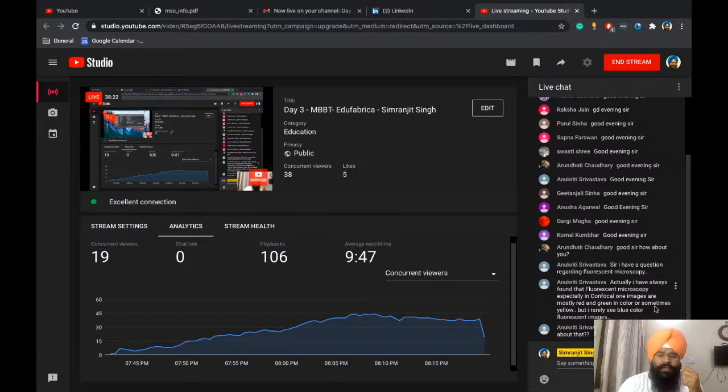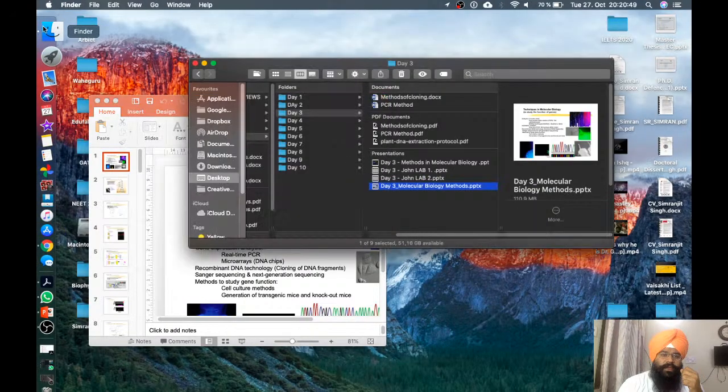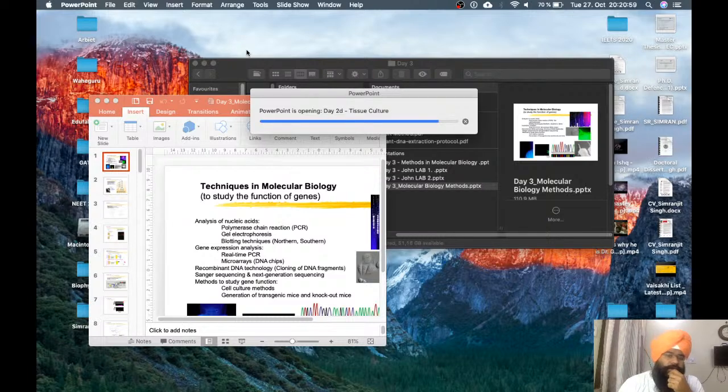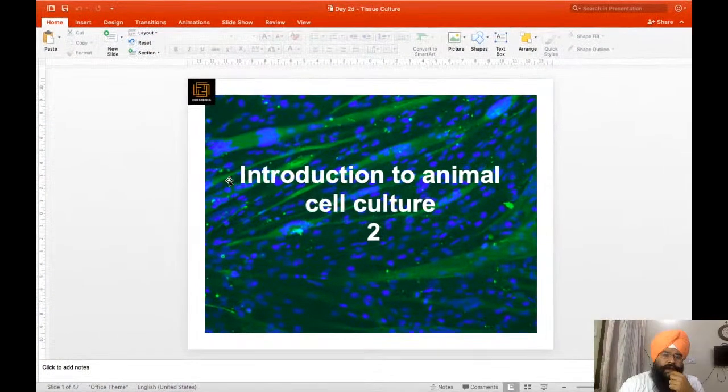Is there any specificity? No, as we discussed just now with our last image, what you were seeing was that the blue was nuclei, and the green was like this image. Blue was the nuclei, and we dye the other things with the other dye. Whatever you dye, that's what you are going to see, because the antibody will attach to that part only, not to other parts. That's how the biochemistry of antibodies works, specifically to the nucleus and to the myotubes in this case. That's why the fluorescent images look like that.